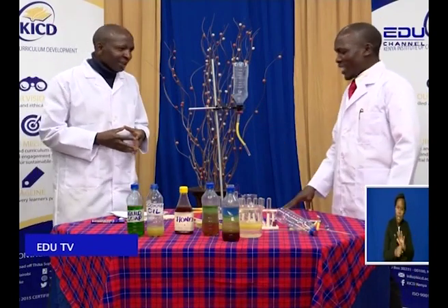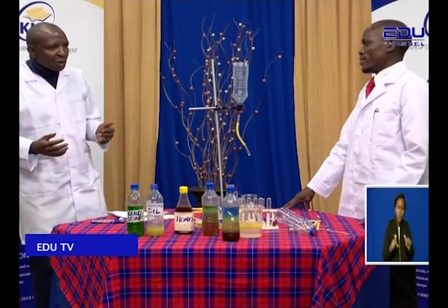And Malimu, karibu sana to the show as well. I am so excited. I remember this was our setup for the last episode, right? I am sure that it was kept safe. Because it's the same thing we are using today — I can see we have done very well in maintaining it. Now, let's first run through the objectives of the lesson. In our last episode, we learned how to make a simple separating funnel. Imagine that you are ready with your separating funnel — today we are going to learn how to use it.